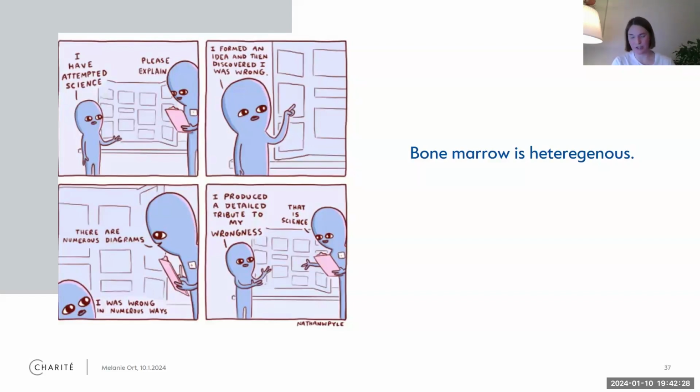So every time I ask a question, hey, have you seen this in human bone marrow? They're like, we don't go that deep into that tissue. So I actually went back, and it could fill another whole talk. I went back to the clinic, asking my colleagues for more bone marrow samples, working with the core unit, trying to figure out what is natural heterogeneity between patients and what is an observation that I have in vitro or in my 2D or 3D culture.